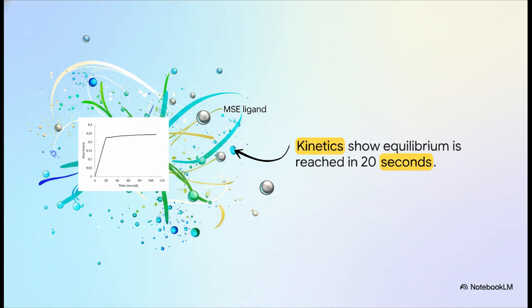Plus, observe how the curve flattens out. It remains completely stable for at least 25 minutes afterward. This gives the laboratory analysts plenty of time to transfer their cuvettes and take their spectrophotometric readings without any panic about the signal degrading or shifting.